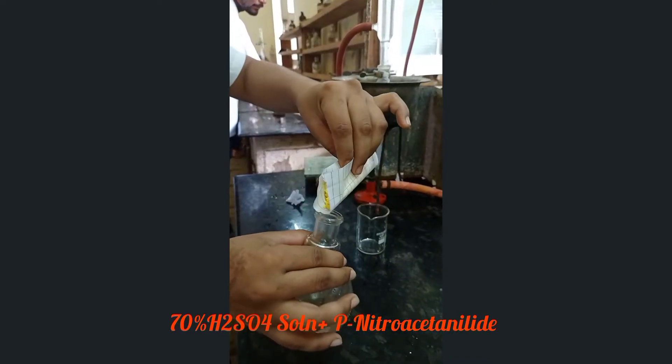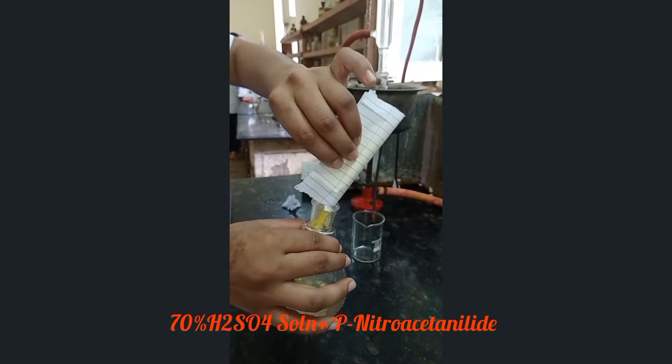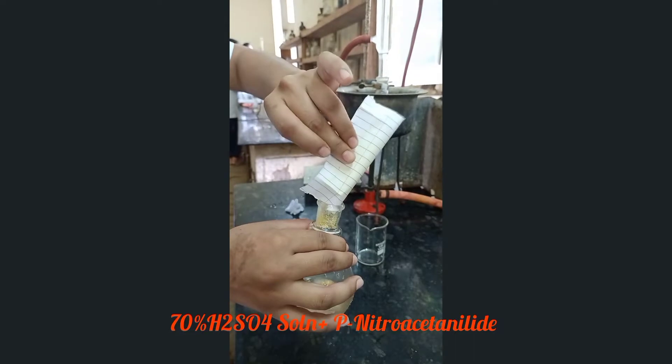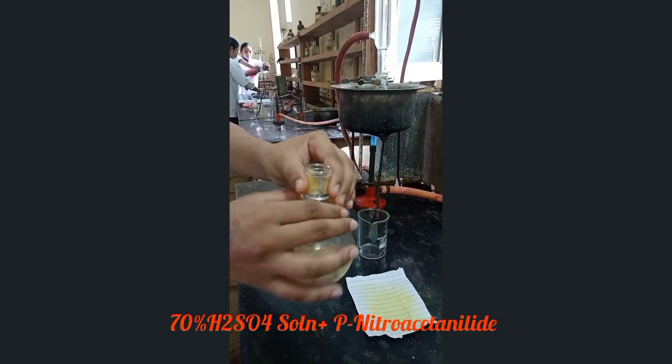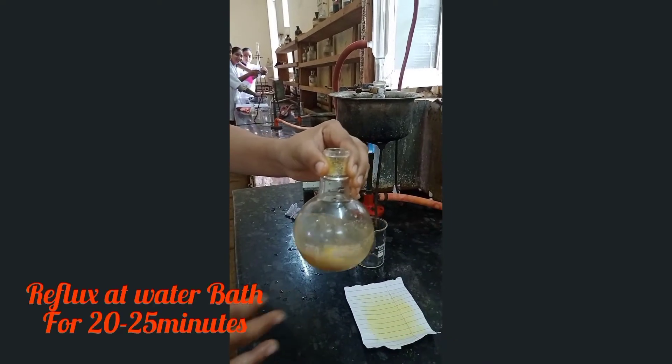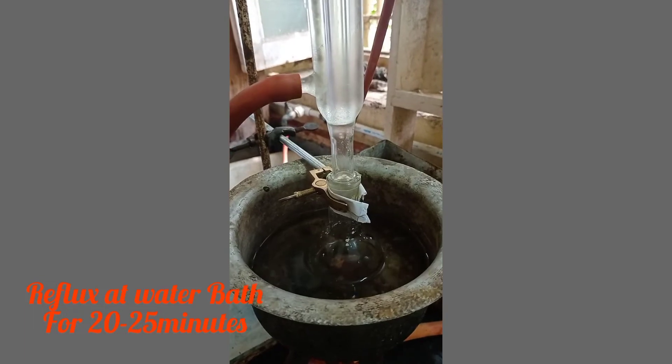Then add 5 grams of recrystallized para-nitroacetanilide into the flask. Stir the reaction mixture and reflux it on a water bath for 20 to 25 minutes.